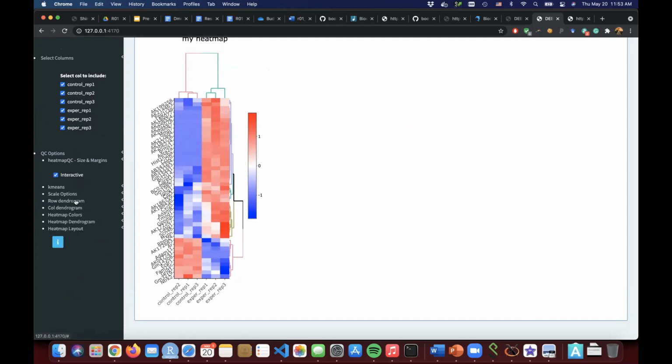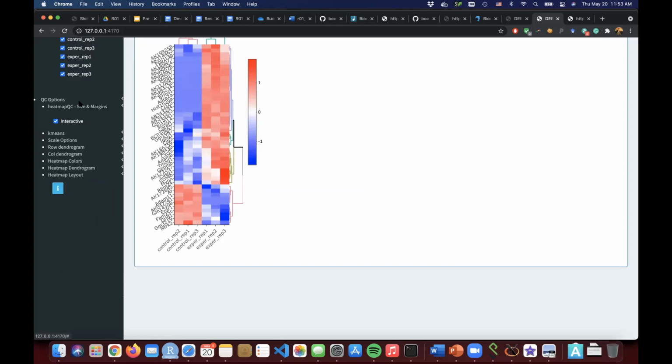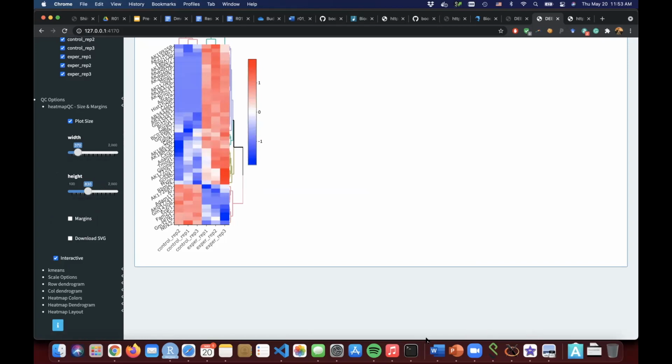But they have functionalities, these dendrograms. When you use correlation, complete, I usually use the correlation and complete, but according to your data, you can try different linkages, different methods, and you can read what linkages are. There are good explanations on YouTube about clustering linkage that you can watch if you want. Any other questions?